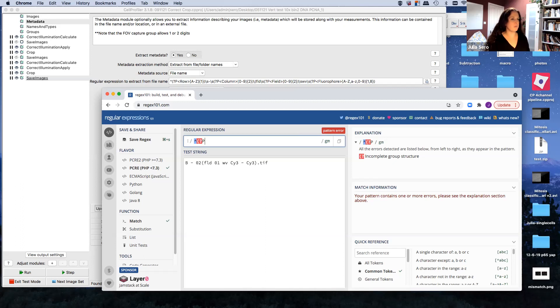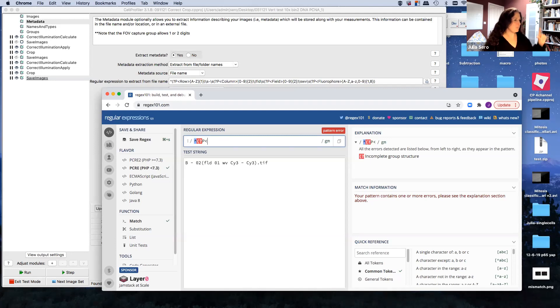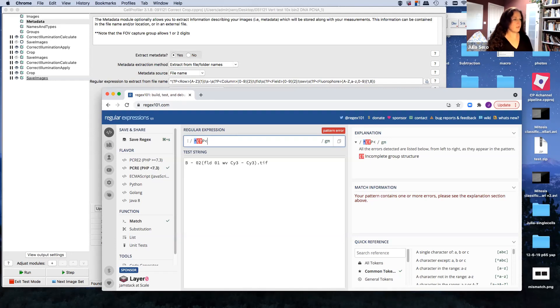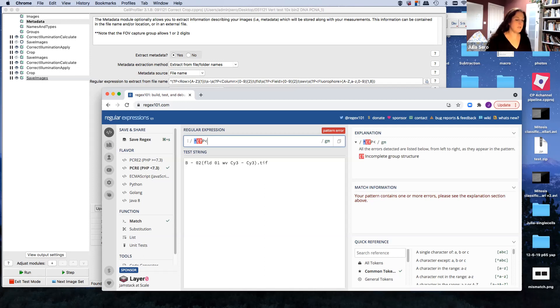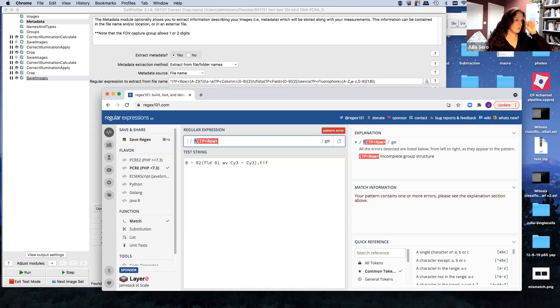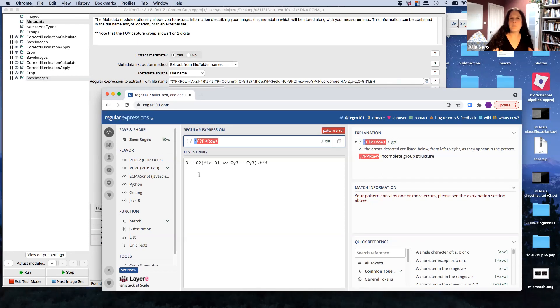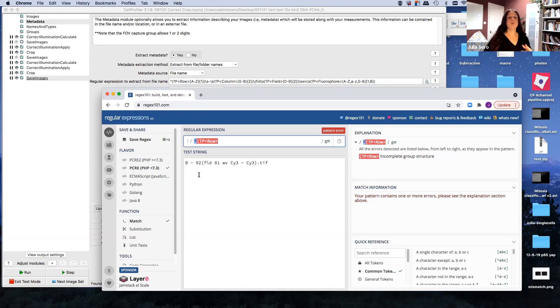And then you're going to define that to be something. So to start that off, we're going to go parentheses, question mark, P. So we're going to start a capture group. Then we're going to go the little alligator mouth. And so we're going to say, this capture group that I'm about to tell you what it is, I want to give it a name. And the name that I want to give it is row, in this case, because we're looking for the row. But you could call it anything you wanted.